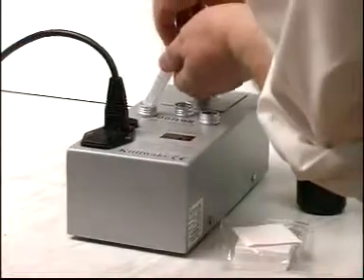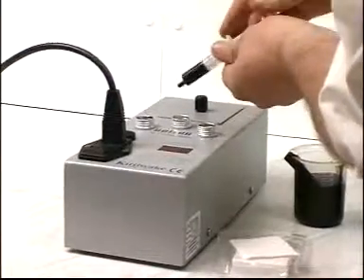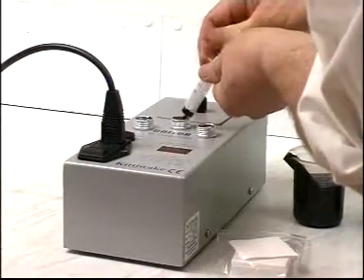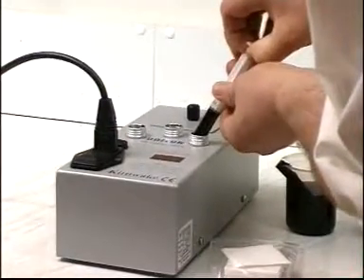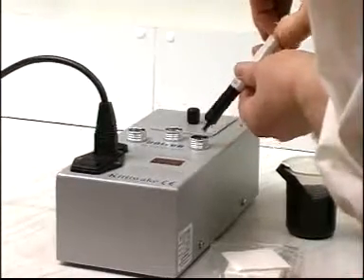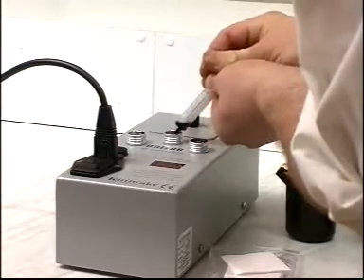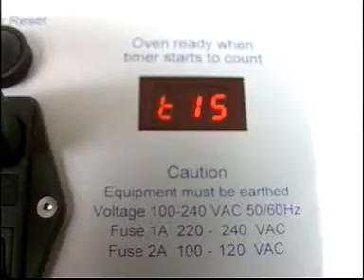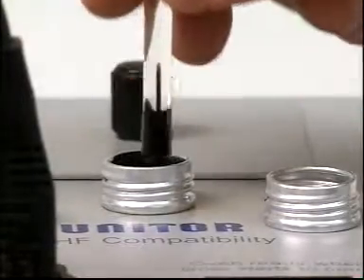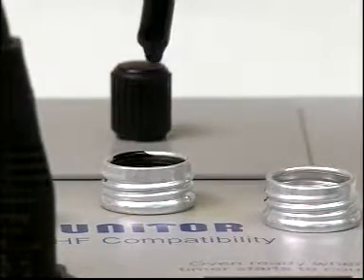Mix these two oils to make a third sample, keeping to the same ratio as the oils are to be mixed in the bunker tank. Place the third sample in the remaining hole and wait for 15 minutes. Stir the third sample for five seconds, then take a spot sample as before. Spot samples may also be made of the two component oils at this stage if needed.